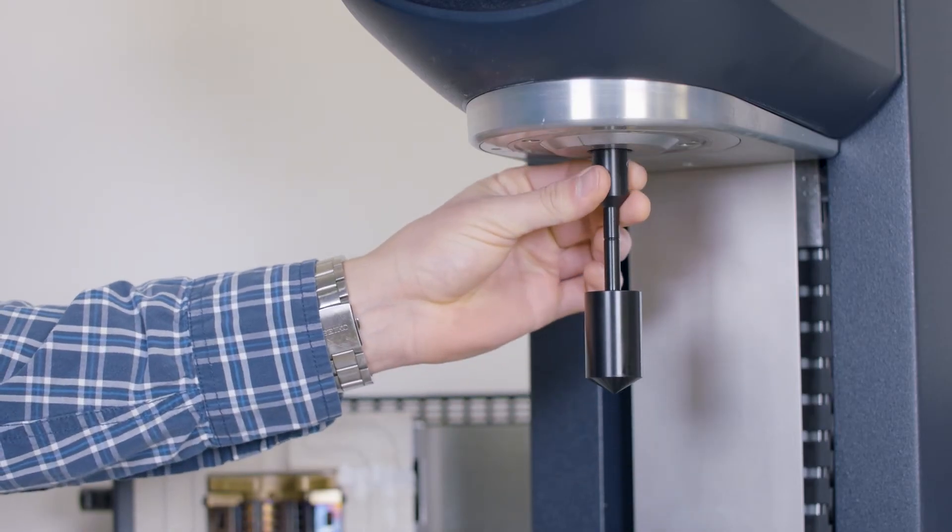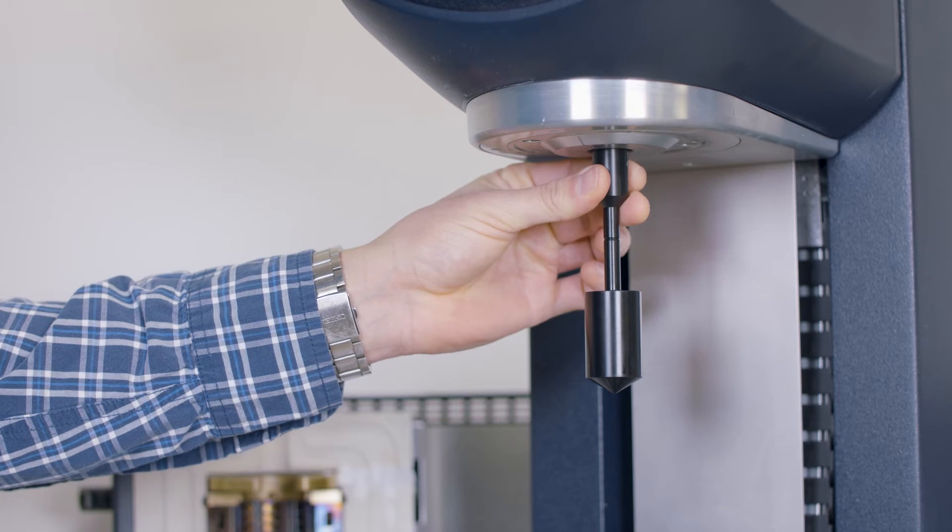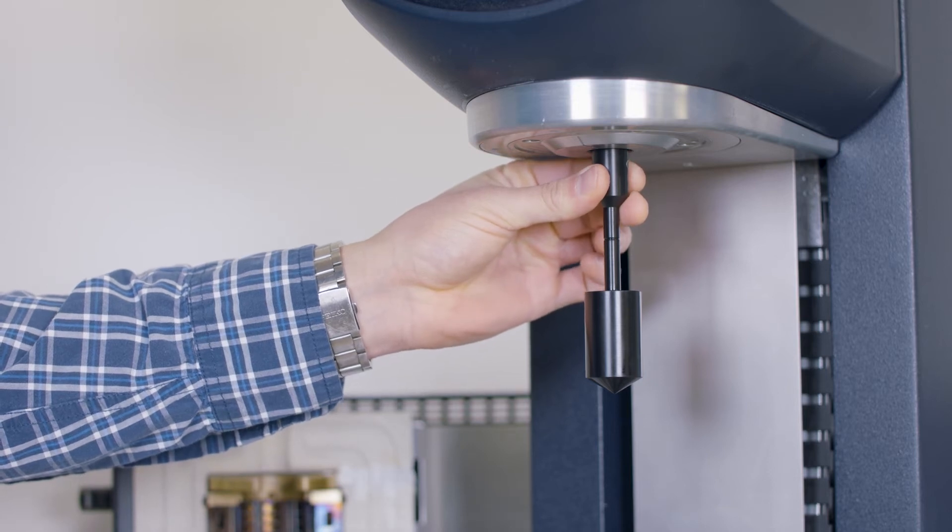Install the upper fixture rotor onto the draw rod by holding the rotor secure and tightening the draw rod.